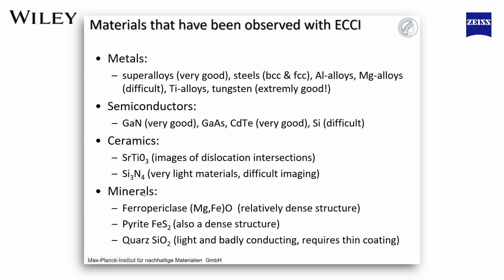And then we have looked at different minerals as well, like pyrite and even quartz, which is actually another challenge because it's not well conducting. It's actually extremely badly conducting. Therefore, we need to apply a thin coating of carbon to image dislocations in quartz as well.